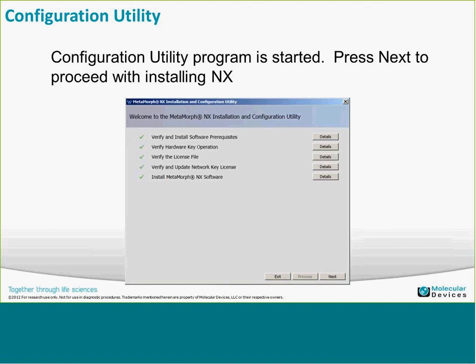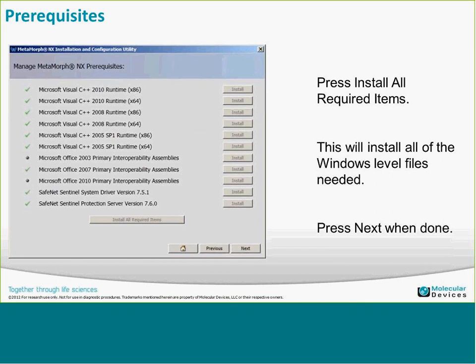You can click Next through the different sections of the installation. The first section is the prerequisites — Windows-level files needed, plus the Sentinel system driver. If you have Microsoft Office, you'll want the interoperable assemblies to send data to Excel or use the export to PowerPoint feature in Metamorph NX. Check boxes indicate successful installation; a triangle means it needs to be installed; an X means it's not installed at all.